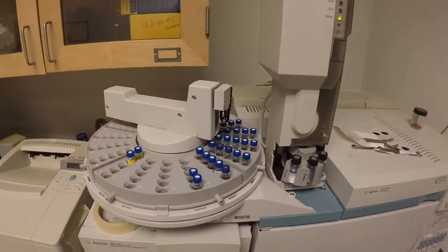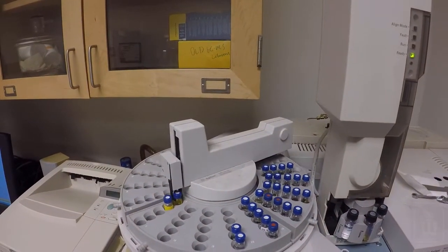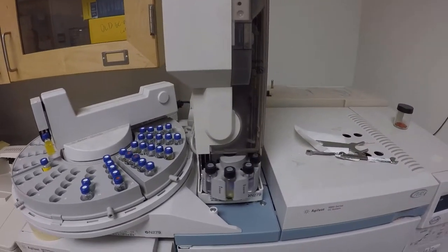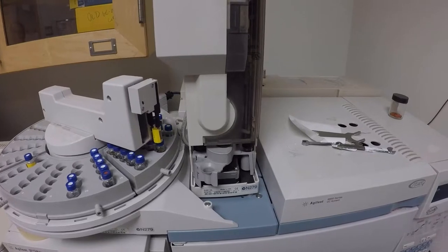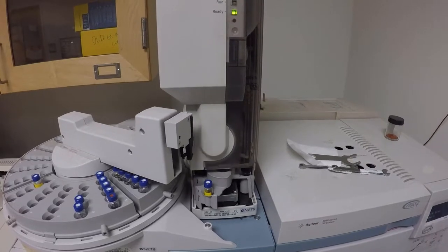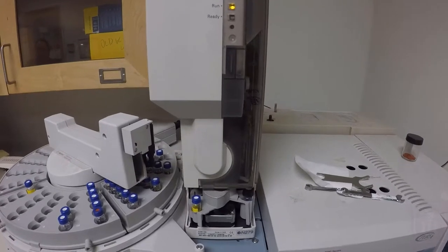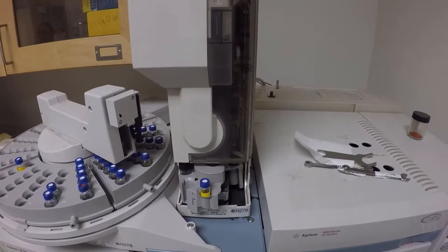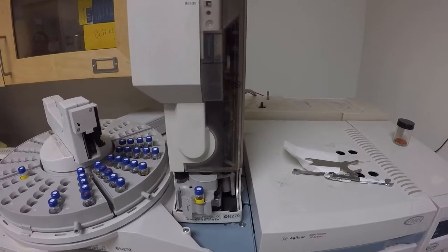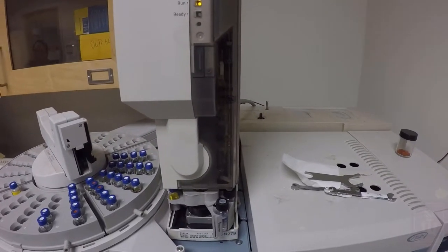Okay. And the beast awakens. It's going to grab the sample here from the tray. See the turrets starting to rotate to take in our sample. And now there's going to be a series of washes of the syringe. It's going to take some of solvent one in and inject it into waste a few times. This is all completely automated. You don't have to follow anything. I just like to sit and watch and make sure it happens right the first time.